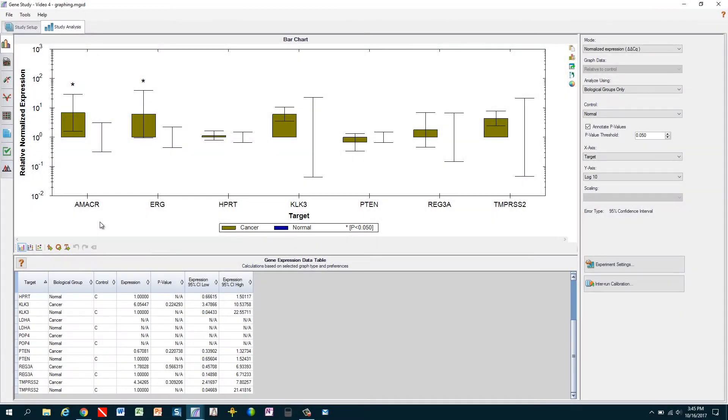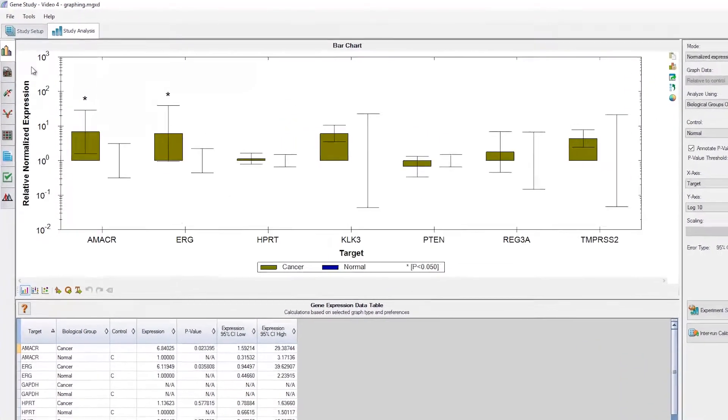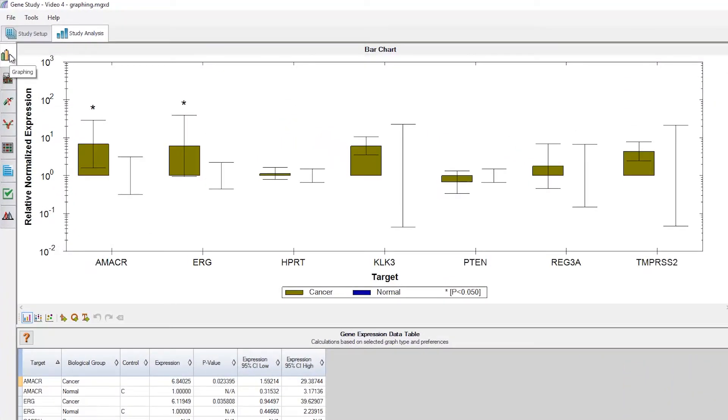This tutorial video will explain how to customize, annotate, and export images in CFXMaestro software. We'll start off in the main data visualization window in CFXMaestro, used for looking at gene expression analysis, and we'll be in the graphing tab.